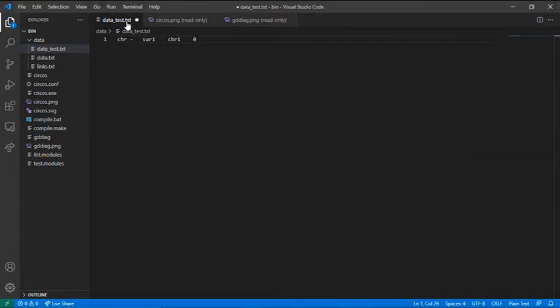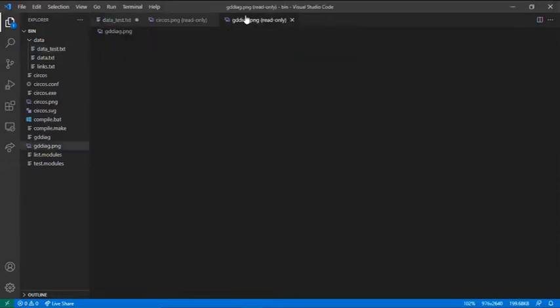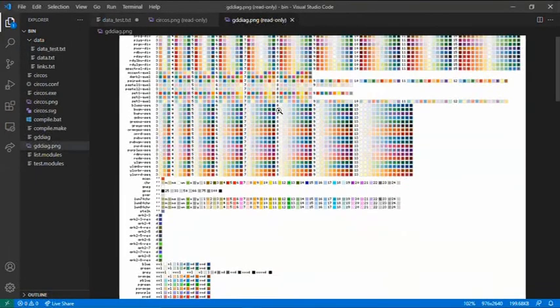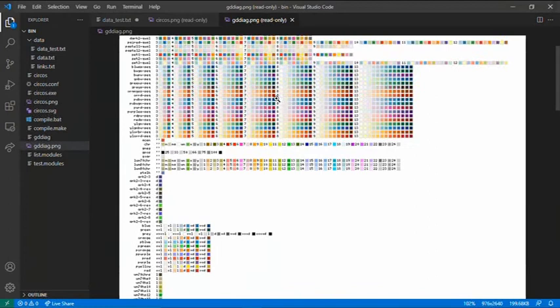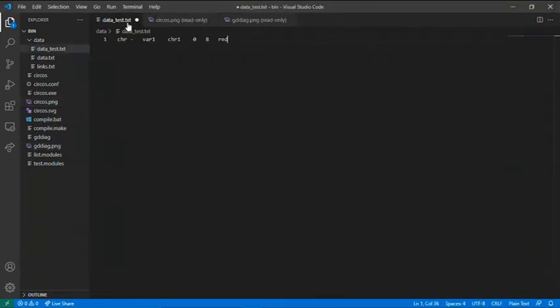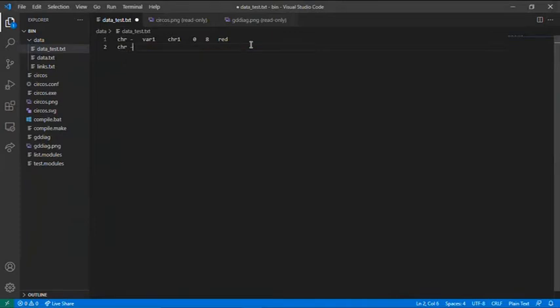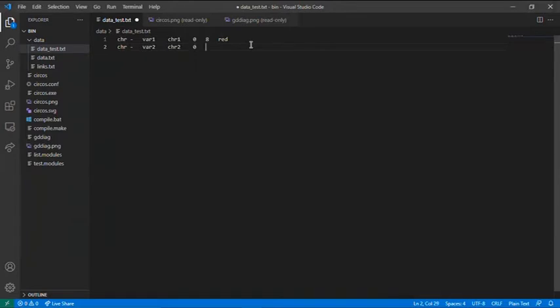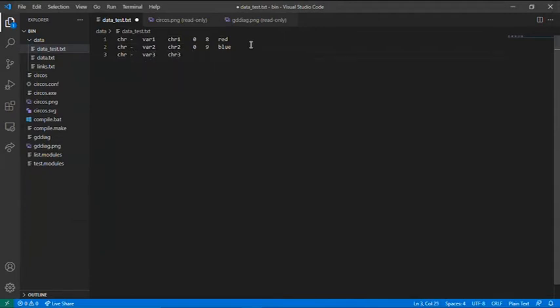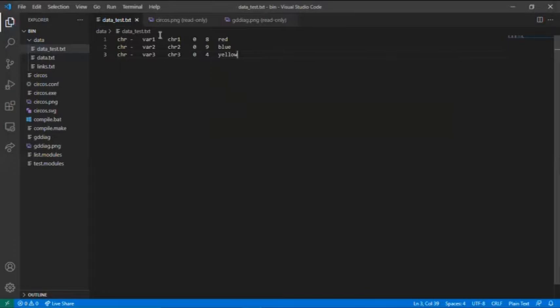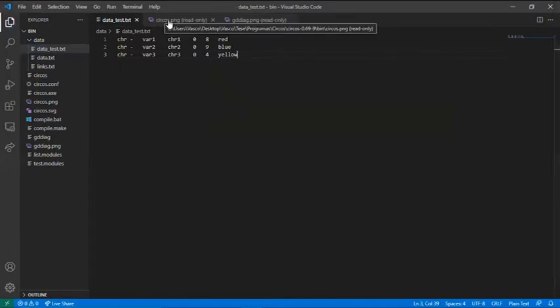How big it is, I will call it from 0 to 8. And the color. The colors you can see on this image, and these are all the image colors you can use on Circos. I will plot two more arcs. And after this, save the text file.